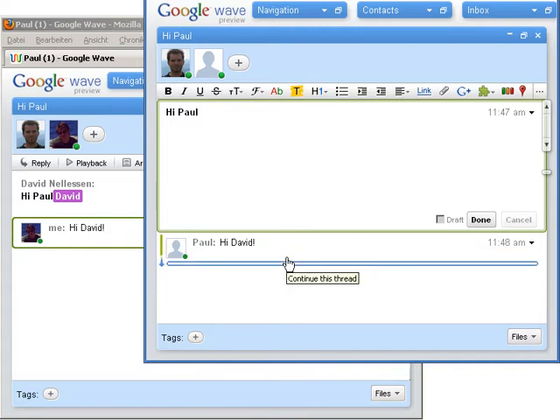But let's not get lost in Google Wave. There are heaps of videos out there. Let's show what SynBioWave is. As I said, SynBioWave is an extension which adds synthetic biology functionality to Wave. And to start SynBioWave, you just need to add the right robot to your conversation.